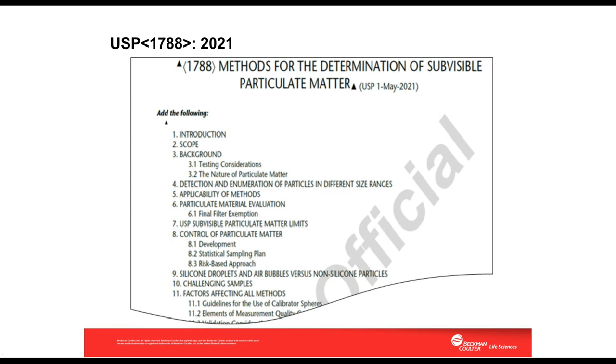And that's the compendial test fail method, but the flow imaging is a useful complementary tool. It provides orthogonal information to help characterize the particle load in products, and it can also be used to help with the forensic examination to identify contaminating particles, to support product improvement, as well as root cause investigations when you have a fail of the HIAC light obscuration test.